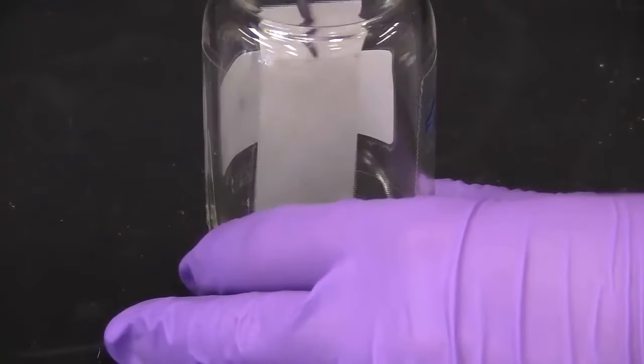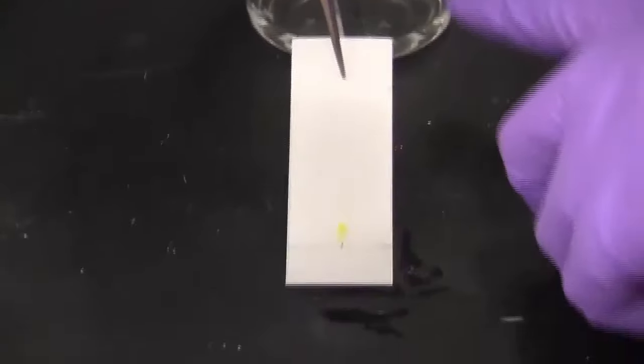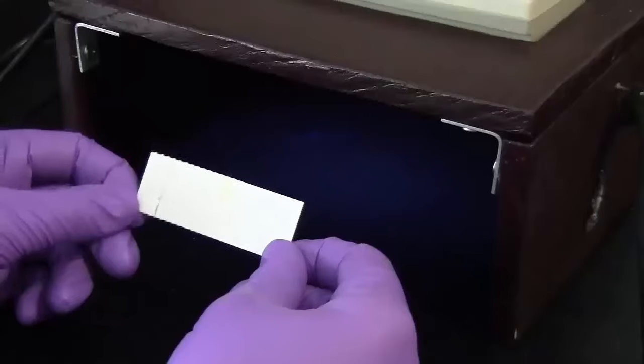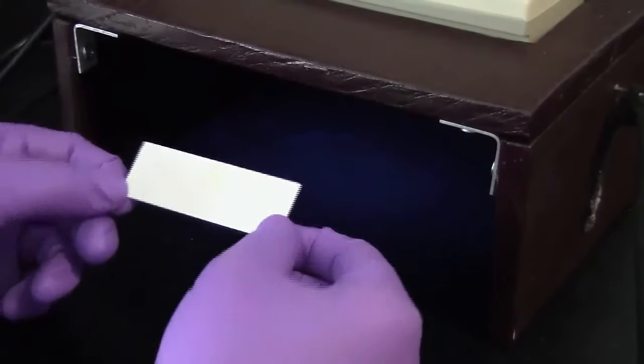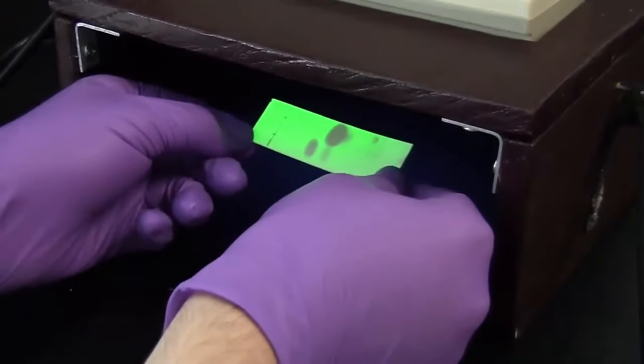Once the solvent line reaches the top line, remove the plate and set it on the bench top to dry. Note, if your sample is not colored, you will have to use a UV lamp to observe the spots.